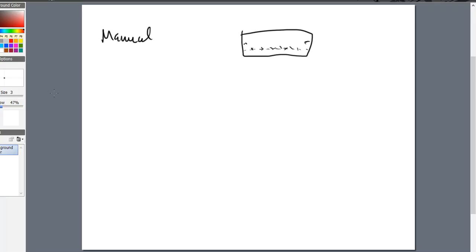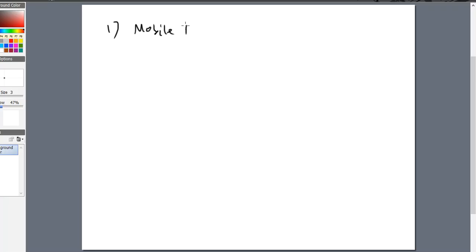So with that said, there's no other place to start than maybe my mobile phase. So the very first thing that I'm going to do is make a mobile phase according to the recipe that I am given in a laboratory situation. So again, terms and words, they're going to come back and haunt me. So I'm not really making mobile phase. I am actually, again, making developing solvent. That is what I'm making. I don't know about you, but that's what I'm making.